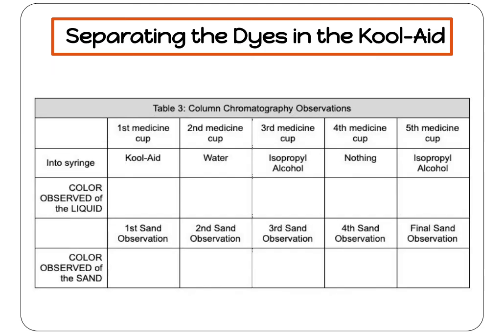You all have done such a great job today. Based on Table 2 from Part B and Table 3 from Part C, we can conclude that purple Kool-Aid is really made of red and blue dyes. You just watched chemistry at work. I hope you had fun today investigating all the different ways that we can separate mixtures.